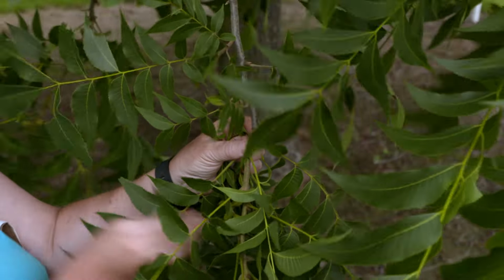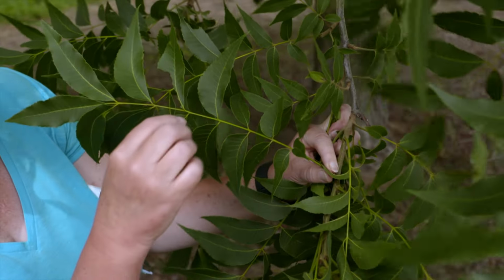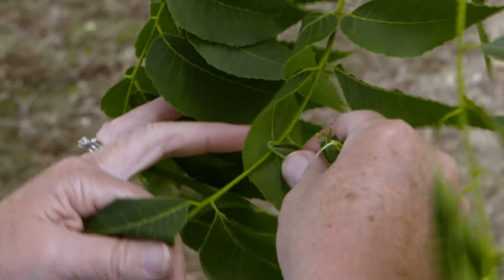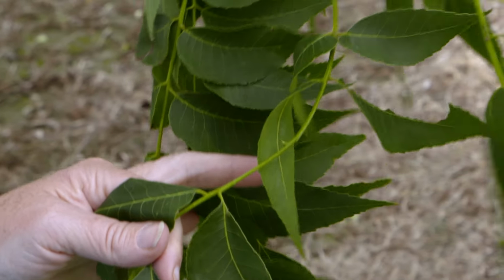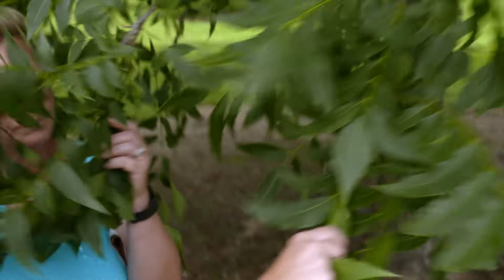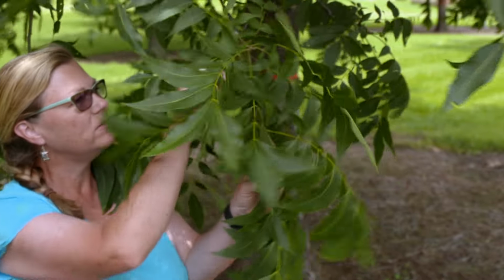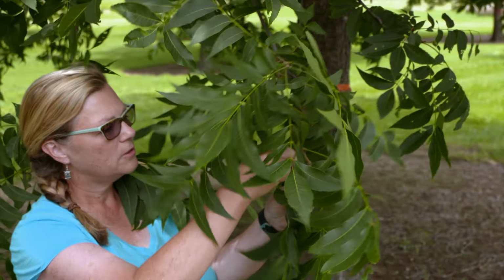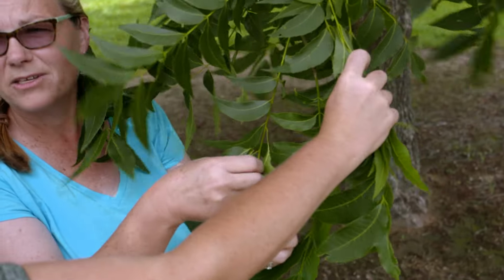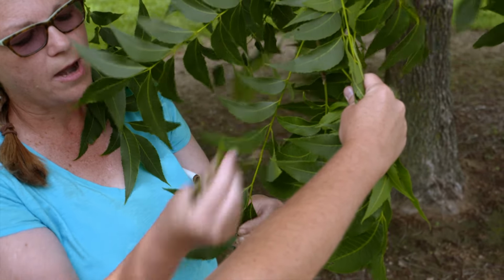So we're going to find this middle compound leaf, and we're going to find the middle pair of leaflets, which is probably this pair right here. And we just snap them off, and this is our sample from this terminal. Then we'll go to the next terminal to get another one. On this one, we'll find the middle leaf, probably this one. The middle pair, we don't have to be exact, just in the general area. It usually just snaps right off, just like that.